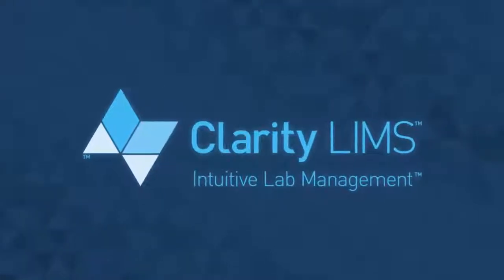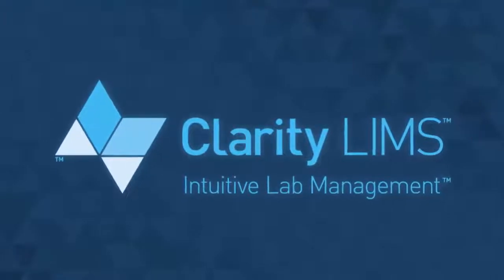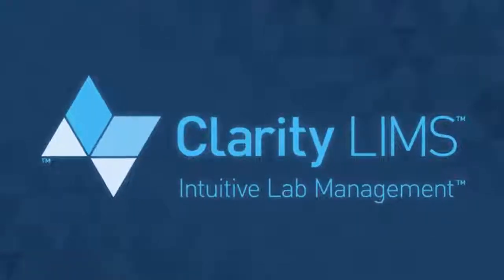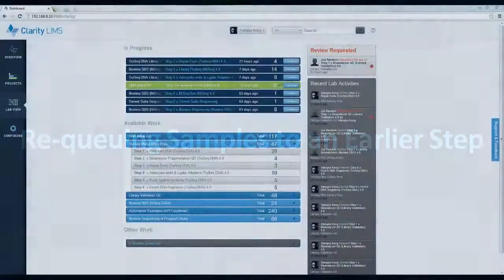Hello. In this video, we will look at how to requeue samples to an earlier step of the workflow within the Clarity LIMS interface. This is a lab manager or system administrator only functionality. If a lab scientist wants to requeue samples to an earlier step, they can initiate the process by first escalating samples for review. There's a training video in the same section that shows you how to do that.